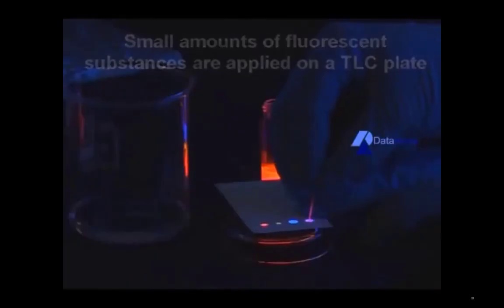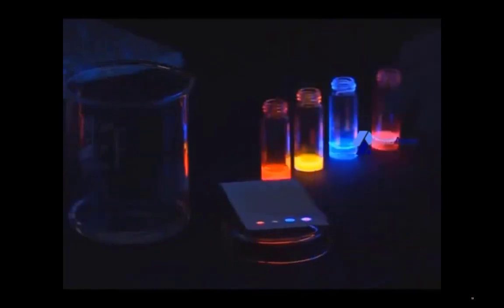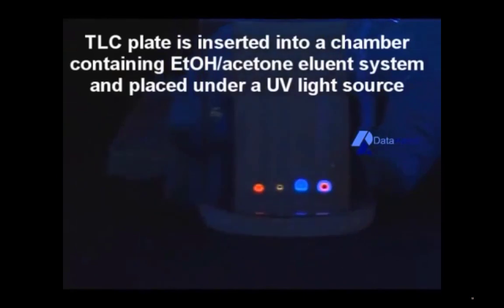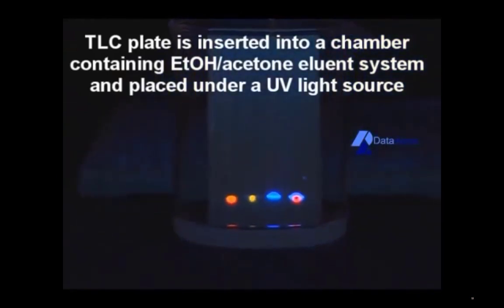In case of a fluorescent compound, what do we have to do? We put the fluorescent sample over the strip, then put the whole system under the UV light source. You can see the fluorescence band under the UV light, which is traveling along with the solvent. So we do not need a further process of detection.